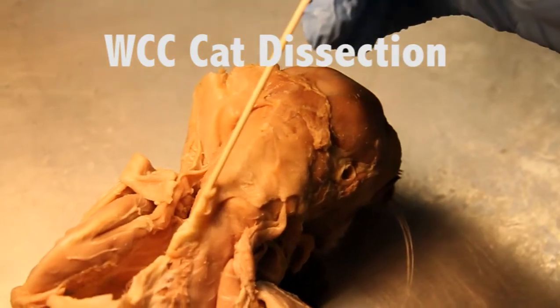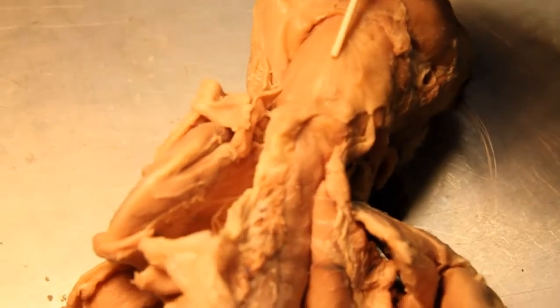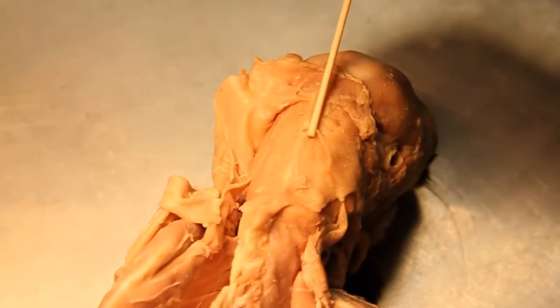Right here is our rhomboidus, and here is the rhomboidus capitis.